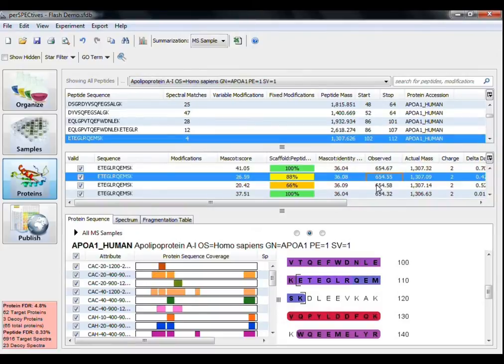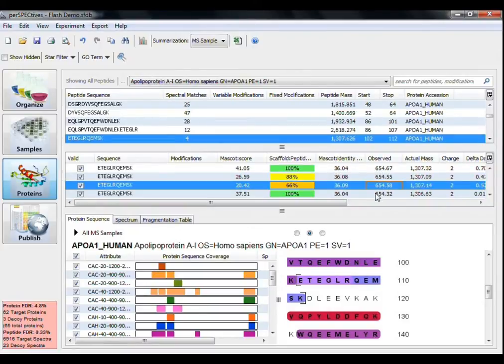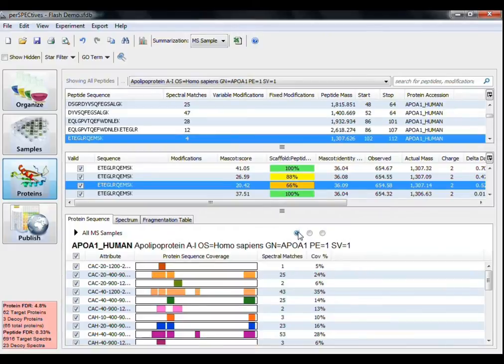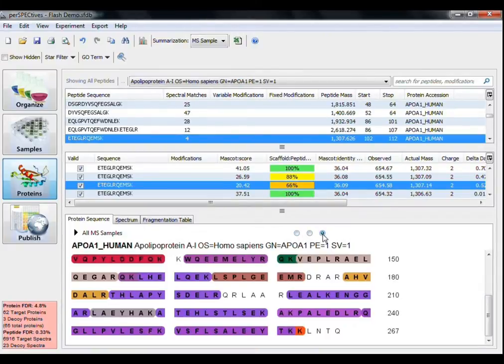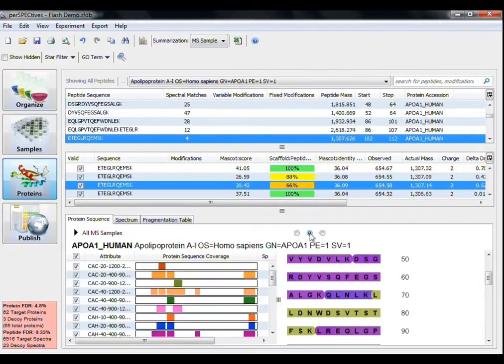The Protein Sequence tab is split into two sections, the Sequence Coverage Comparison and the Sequence Coverage Display. You can toggle between displaying the one or both of the sections using these buttons at the top of the pane.